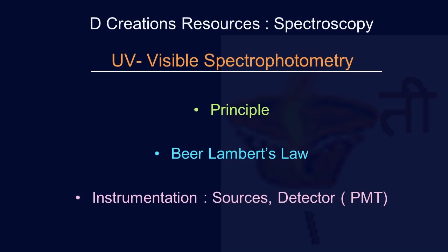So due to this, the darkening of the glass is also prevented, and brightness is maintained over a longer period. Now there is another option for light source, and that option is xenon lamps. These can cover both UV and visible region, but of course they are very costly. So they may not be used where one needs an economical source.